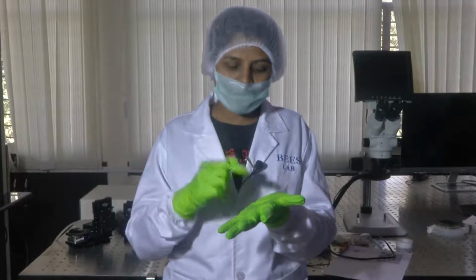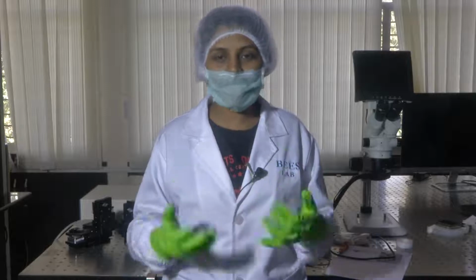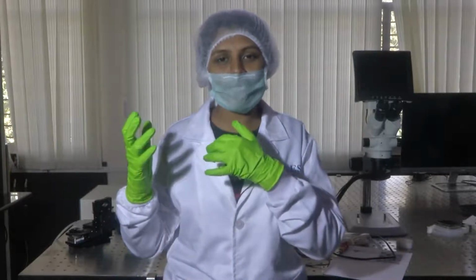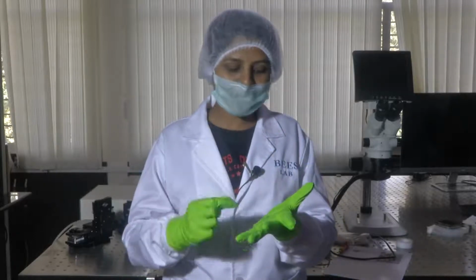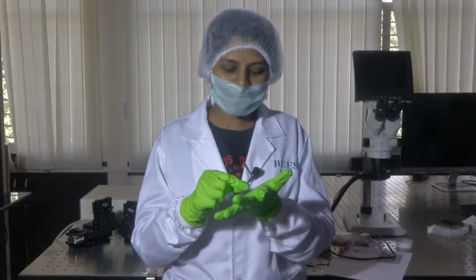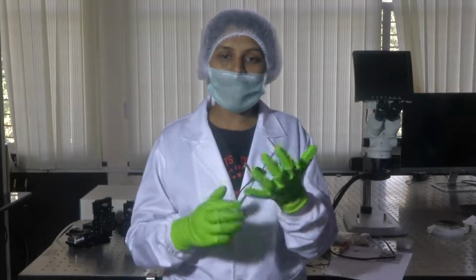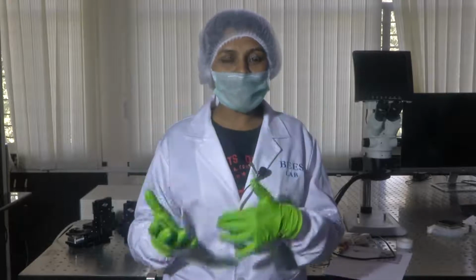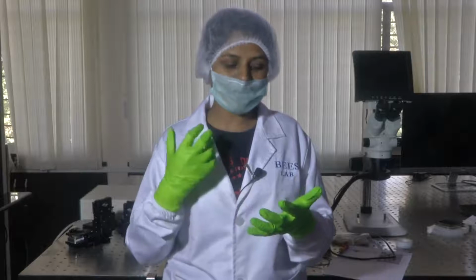In order to do this, this is where the micromanipulator comes into place. In order to apply a force on a very precise scale, and if it has to be repeatable, the use of a micromanipulator becomes very handy for us.